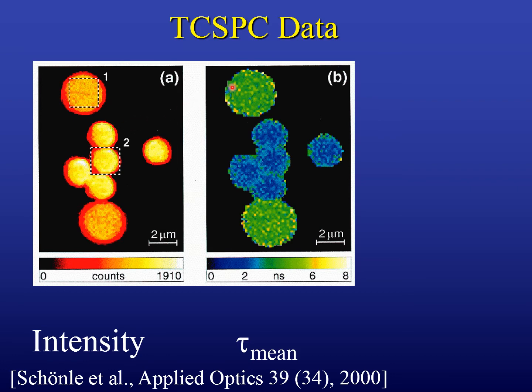As you see here, there seem to be two different particles. These are plastic beads, essentially, if I remember right, or some liquid droplets or something like this. They are two different kinds: the small ones are one type of material, and the other ones are another.